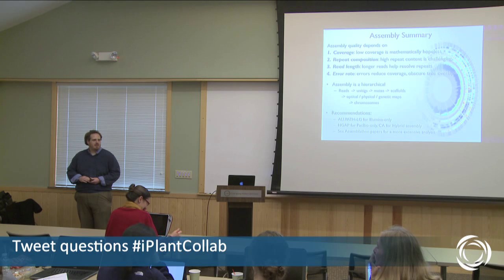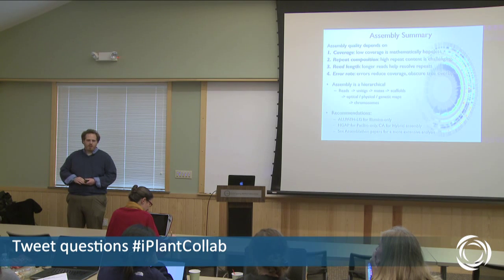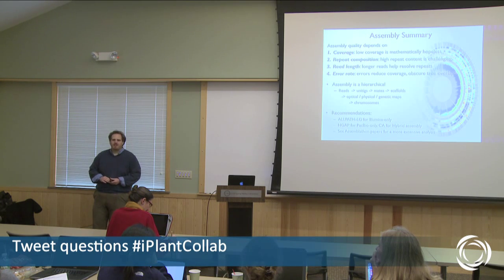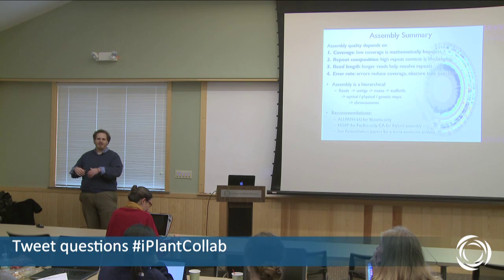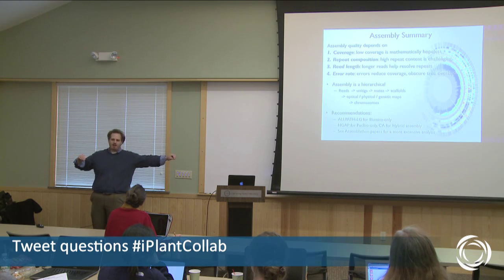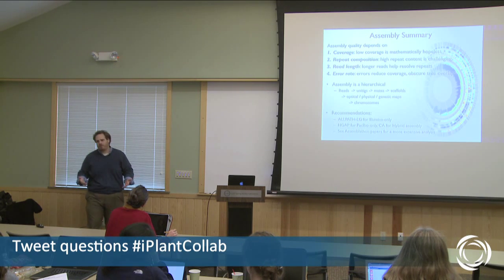So the assemblers have really been designed around the human genome, which has about 1 in 1,000, a very, very low percent of heterozygosity. People are starting to transition to more complicated genomes. There are a few projects just scratching the surface on it, but it's a hard problem, right? Because of the heterozygosity, it's like taking A Tale of Two Cities and then another copy of A Tale of Two Cities that has mistakes along the way, scrambling up all the data. If everything is perfect, you get this nice bubble structure encoding all the heterozygosity. In reality, though, there are these bubbles, but then there are repeats, so it gets tangled, and then there are errors, so it gets more fragmented. It's just really hard to work with from short reads.